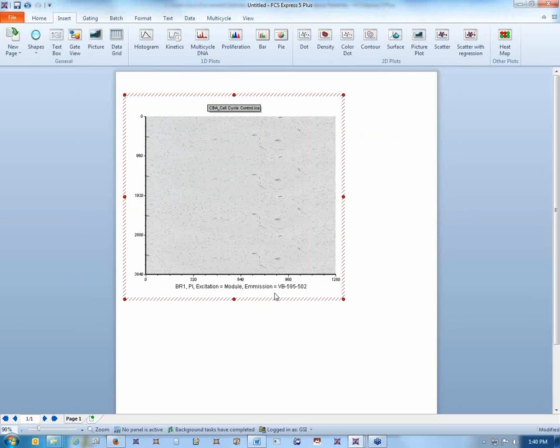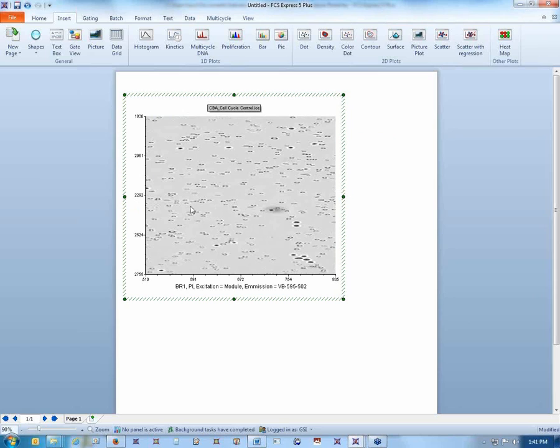So there's a lot of cells on this image. You can see a lot of little specks, so each little gray speck is a cell. I'm going to zoom in so we can at least just see a little bit more detail. So we'll zoom in. So hopefully now you can kind of see the membrane. I believe this is a phase image, so that's why it looks a little bit gray like that.